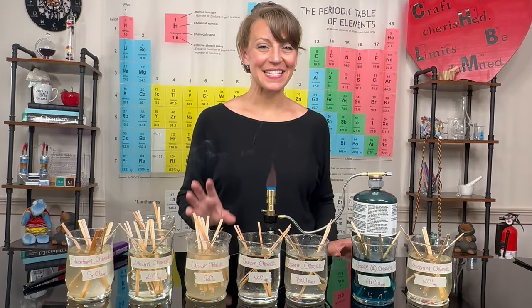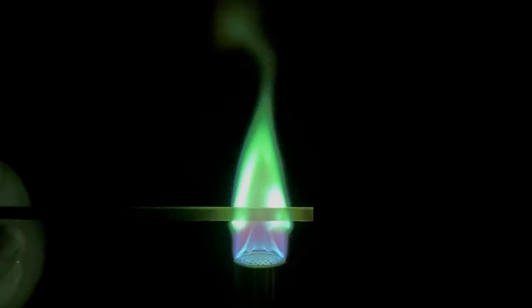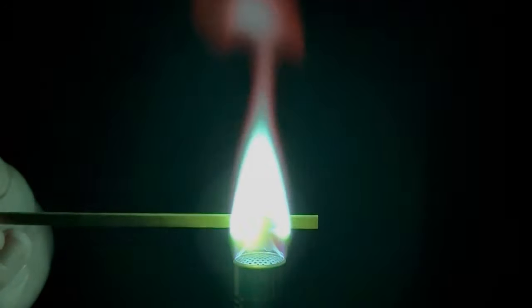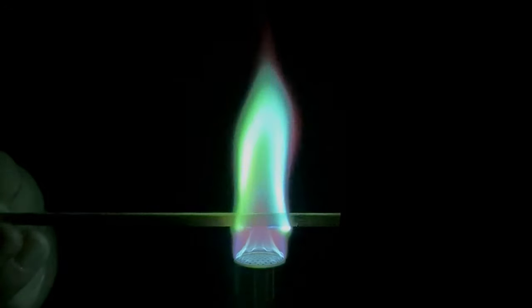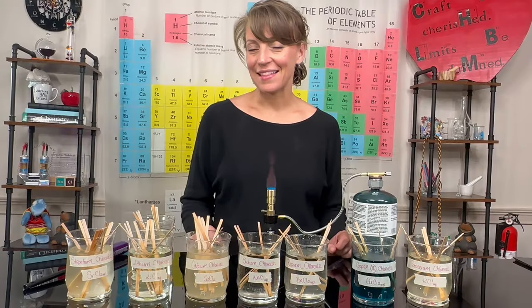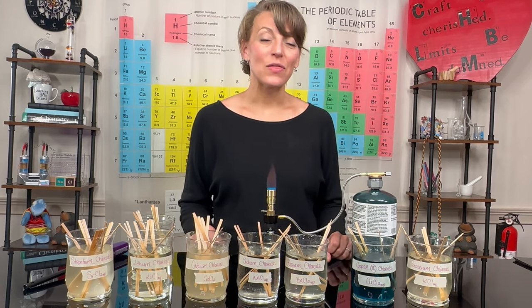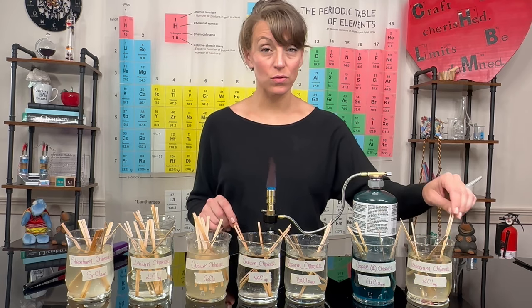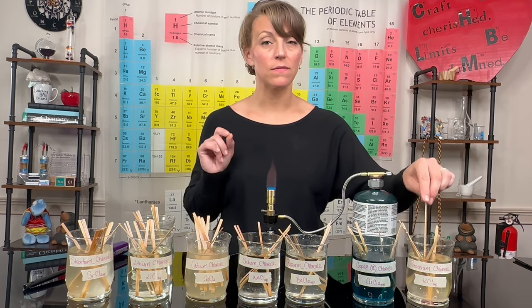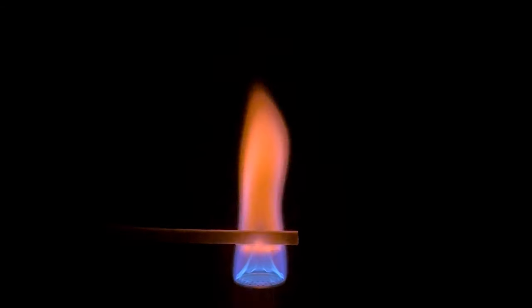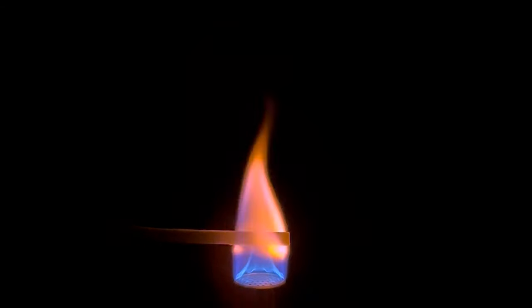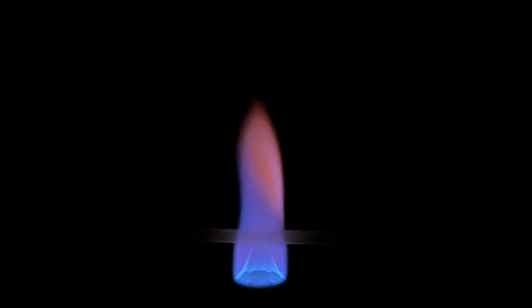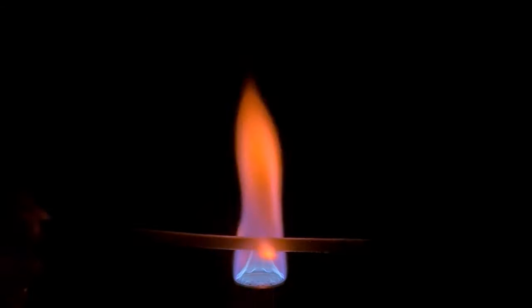Barium chloride creates an awesome green flame. And just wait until you see copper chloride — copper chloride produces a spectacular blue-green flame. I mean come on, look how pretty that is. Last but not least we have potassium chloride. With this one you have to be very observant because the color change, the true color change, is very faint. If you look closely on the outer parts of this flame you might see a light lilac or lavender color. This faint purple color is the true color of potassium chloride.